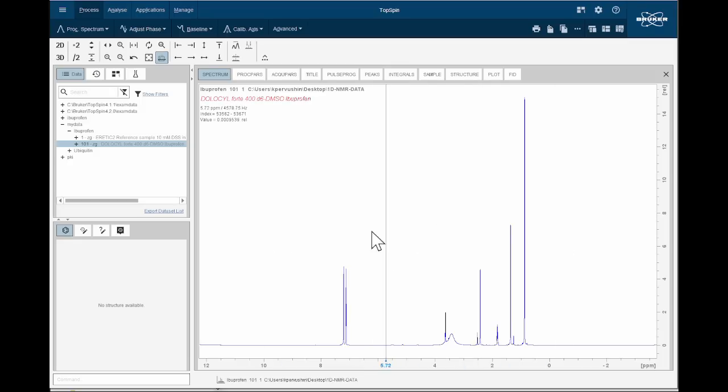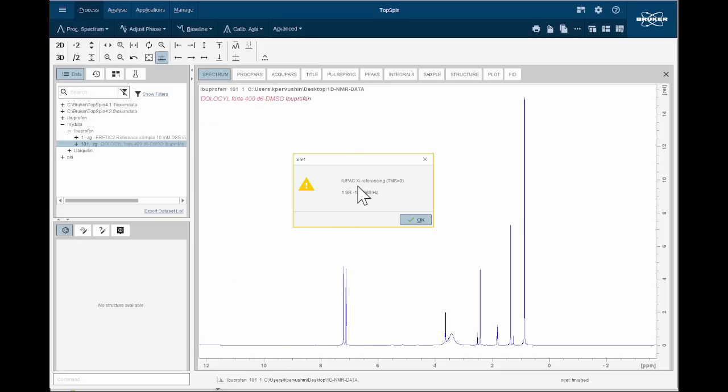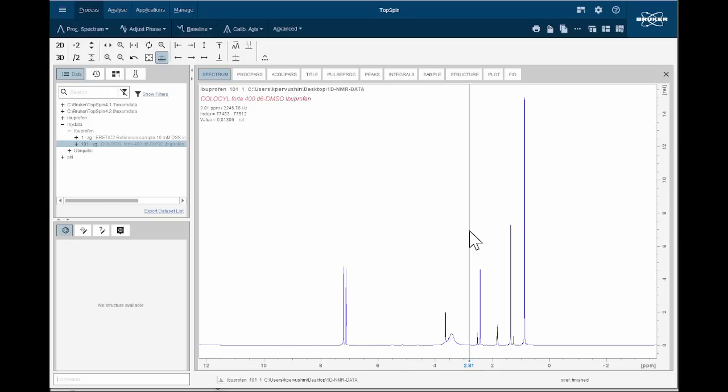Now we can calibrate chemical shifts using the DSS from the spectrum 1. To perform that calibration, we have to issue the command xiref here. It reports that IUPAC referencing has been done and all set. So from this point onwards, we have to start analyzing this spectrum. This can be done in steps again, and the first step would be to take integrals of all of these peaks and perform the general analysis of the spectrum.